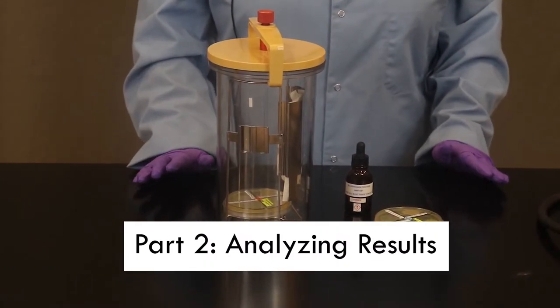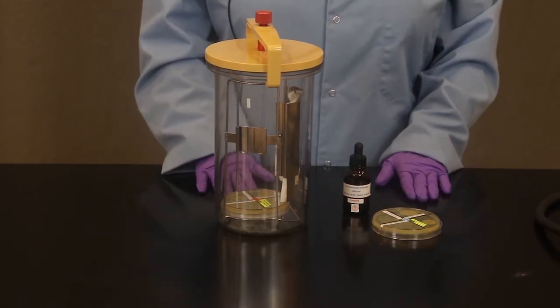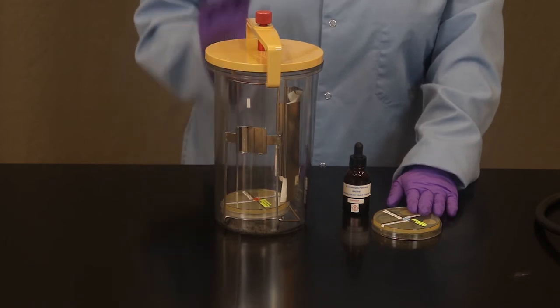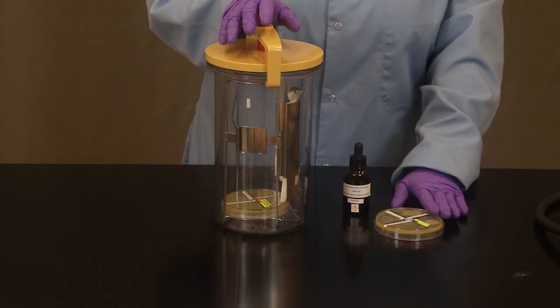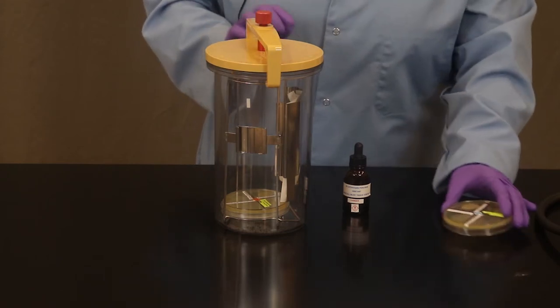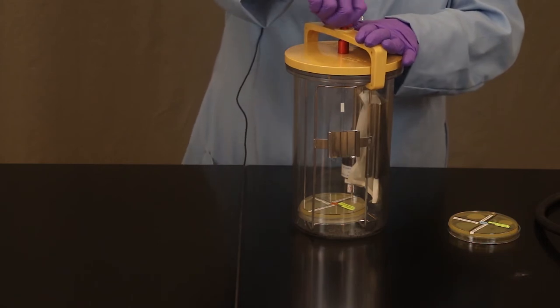Welcome to the second part of the oxygen requirement lab. Now that our petri plates have incubated in an aerobic and anaerobic condition for 24 to 48 hours, we're ready to examine our results.